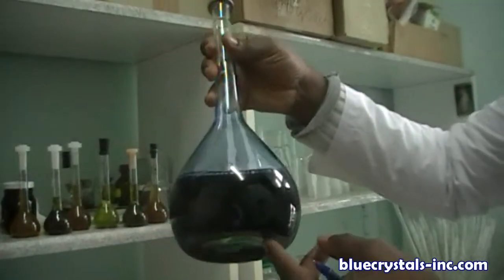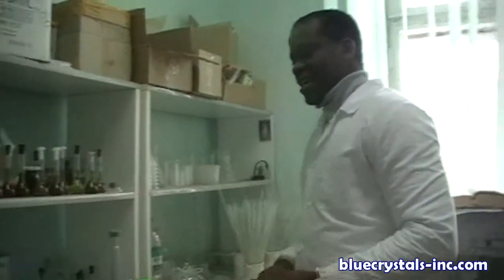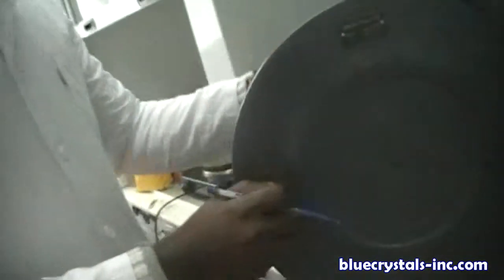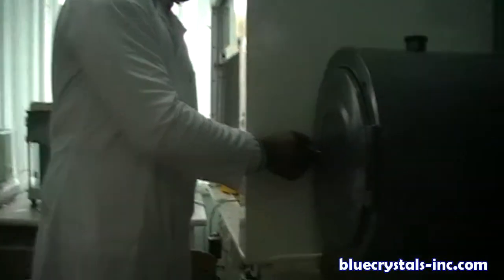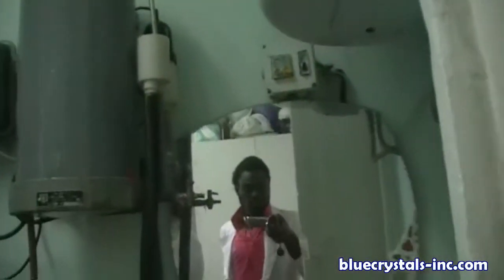Can you tell me what is this blue color in the water out there? This, you can see, is for drying — if you have to use vacuum. An industrial piece for purifying water, aqua purificata, for purifying water.